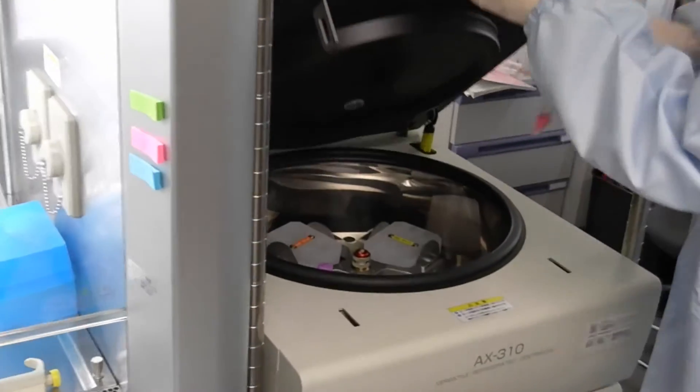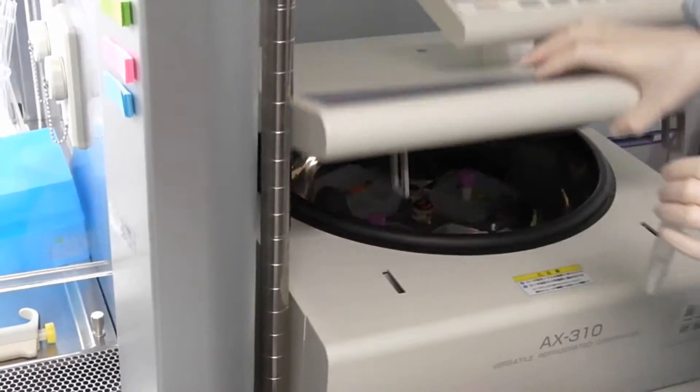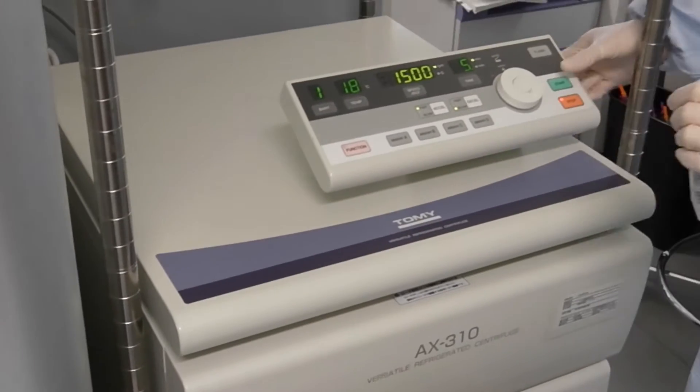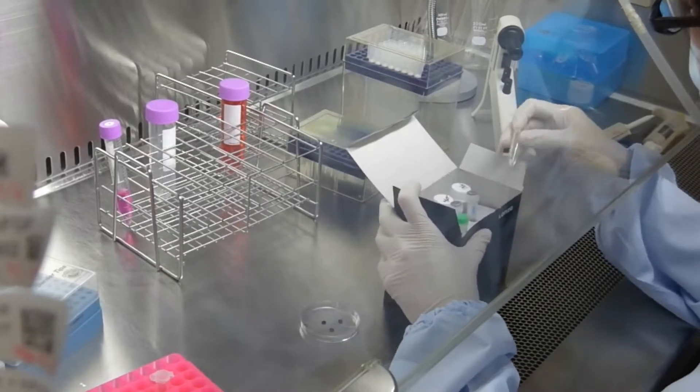The pre-cultured mononuclear cell suspension is centrifuged at 200 g for 10 minutes. At this time, acceleration and deceleration modes are set to slow.